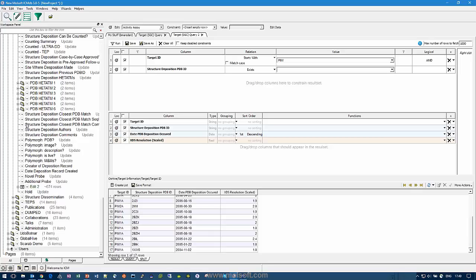You can export to an SDF file if there's a compound column involved. You can export to an XLSX file, and then those can be imported into other things like, for example, OpenOffice or Google Docs or Office 365 or whatever makes sense. We've only integrated Excel at this point because that's what works for us. But if there is a particular interest in implementing the capability to push to other platforms where that is technically possible, that's certainly something we would consider.